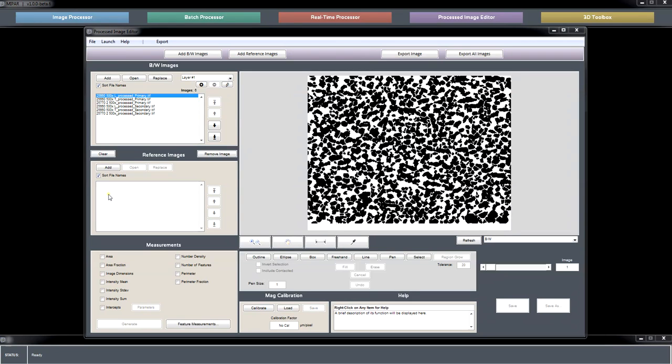We also have particle or grain size analysis, which I think might have even been tied with topic number 4. So for grain size analysis, I know Meg and her team are working with grain images, as many of you are.